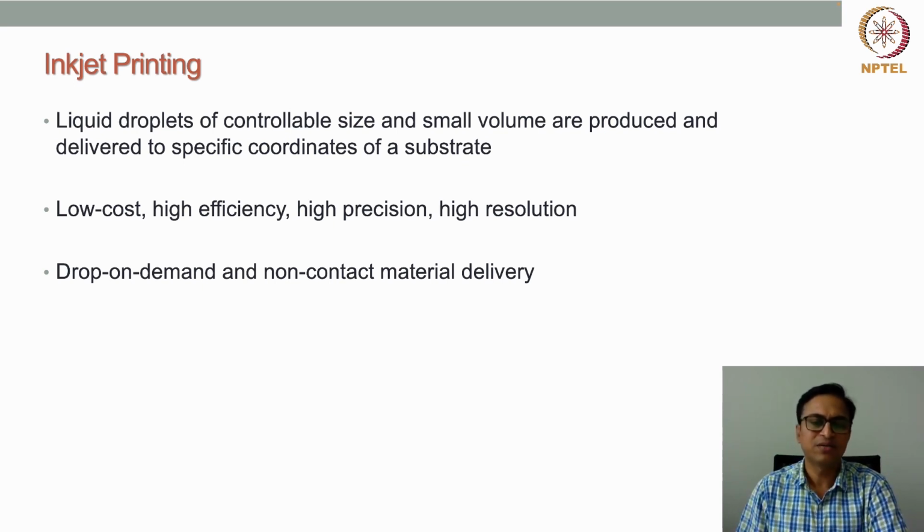Another very important characteristic of this technology is drop on demand. Whenever there is a requirement of a drop of a particular material, only at that time the drop will be produced. So we can control the droplet generation and further the delivery of those droplets to the particular coordinates for printing purposes.